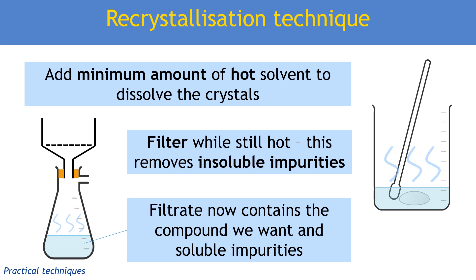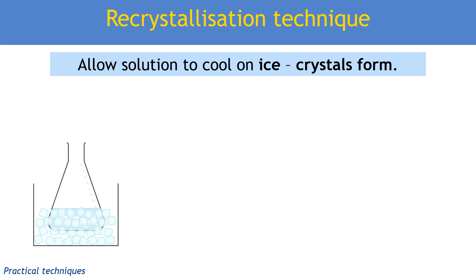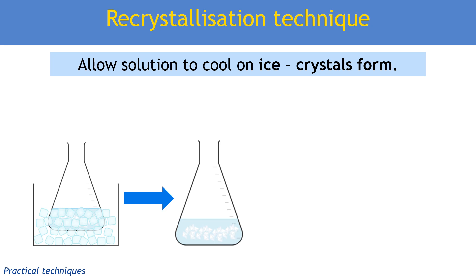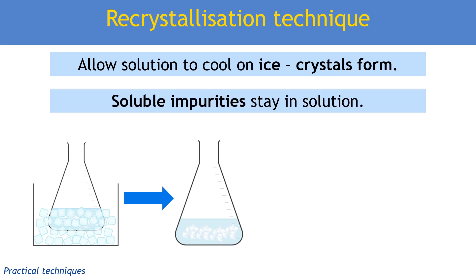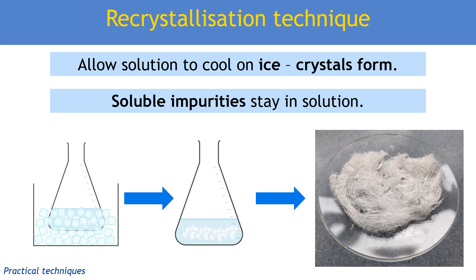What we're going to do now is put that filtrate on ice, or at least let it cool down — most of the time we cool it quite rapidly on ice. That will allow the crystals of the solid, for example aspirin, to form. They will be much, much purer than before, because those really soluble impurities will still be in solution and won't come out. The only thing that should come out of solution is those crystals of what I want — and that's how we get our nice, clean crystals.